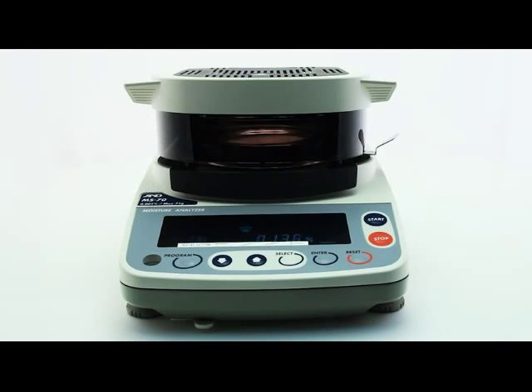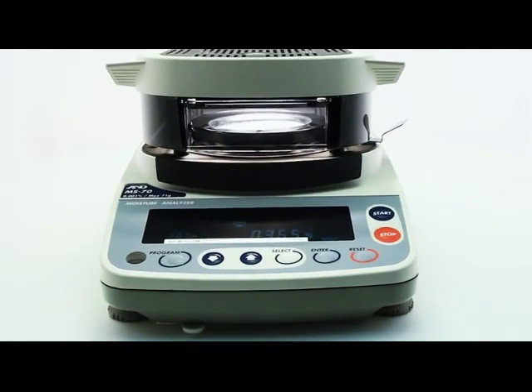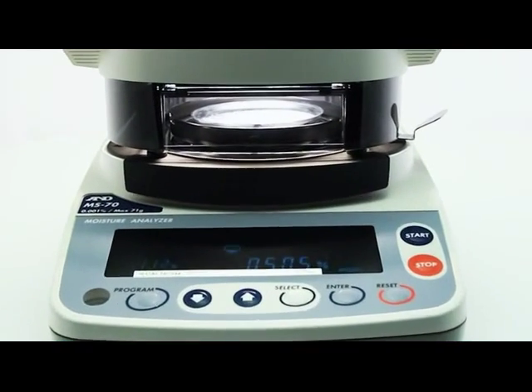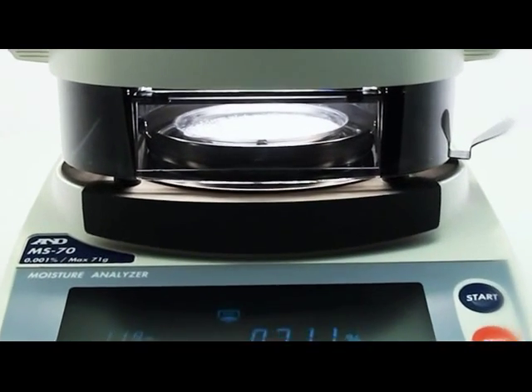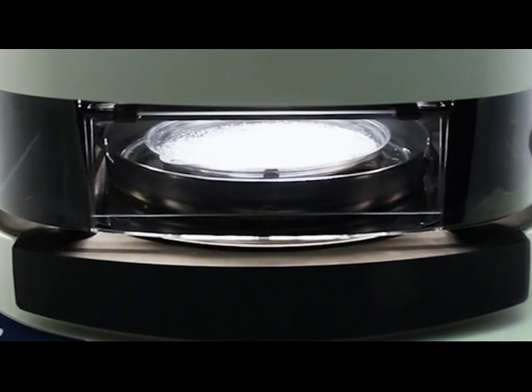With the progress window first offered by A&D, you can observe the drying process and be sure that the sample is not being burnt or scorched.